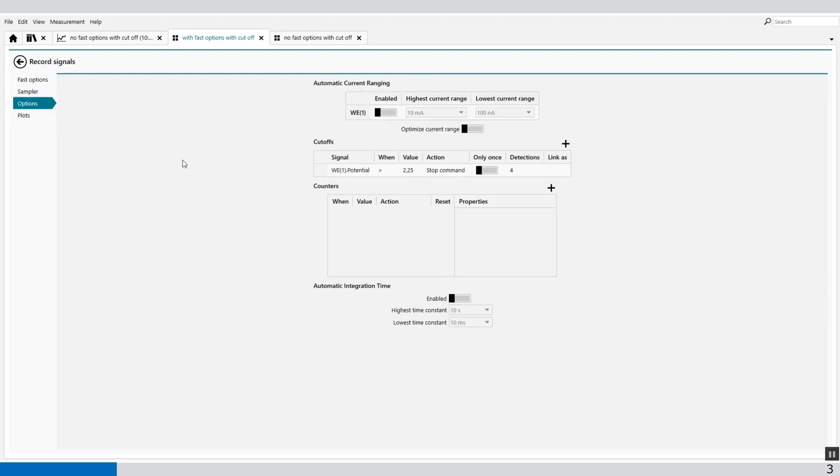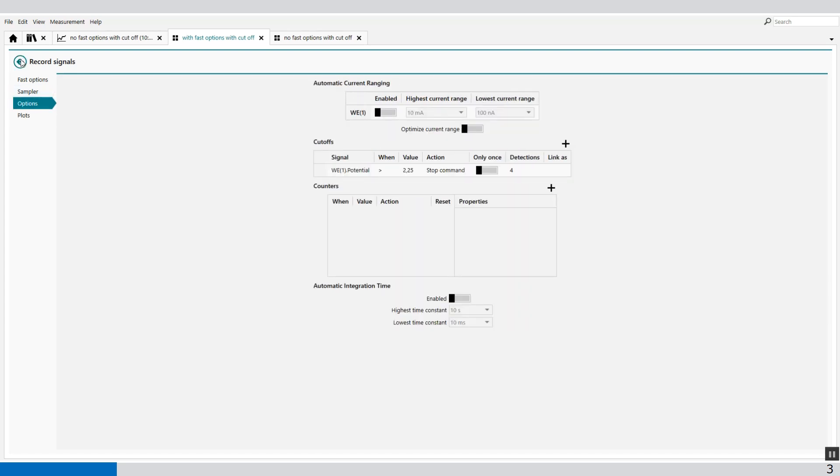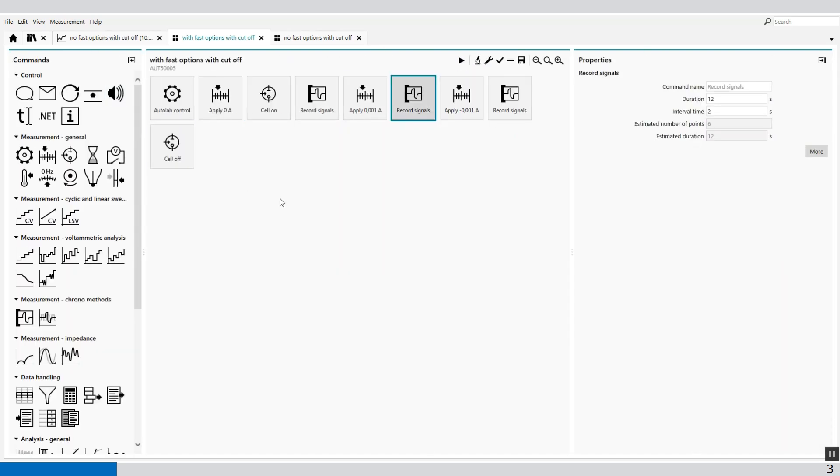And in the options, we use the same options, same option conditions as well. So when I run this measurement, you will see that the cutoff conditions are much faster measured.